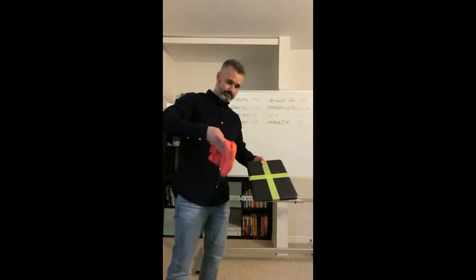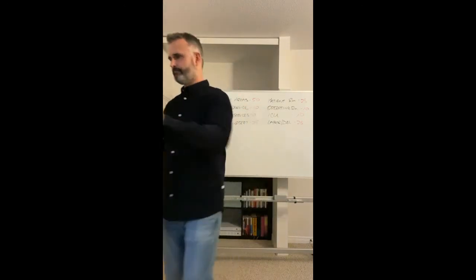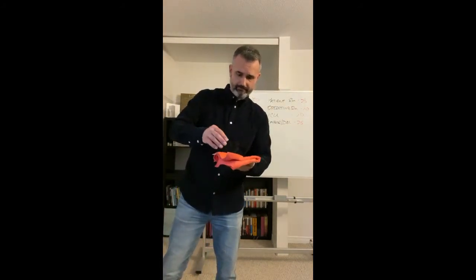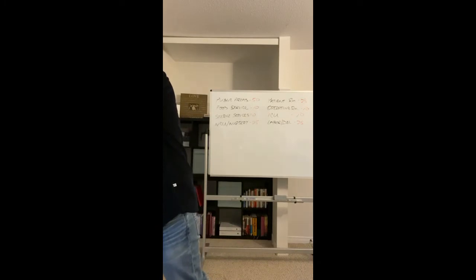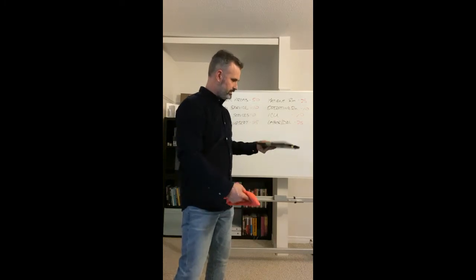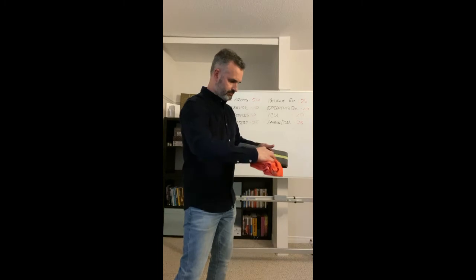So we actually want to, I'm trying to do this without touching it on another surface. So we actually want to flip that to a new surface. Okay, so we're going to leave this one because that's our sanitize only. And we're going to clean this surface.